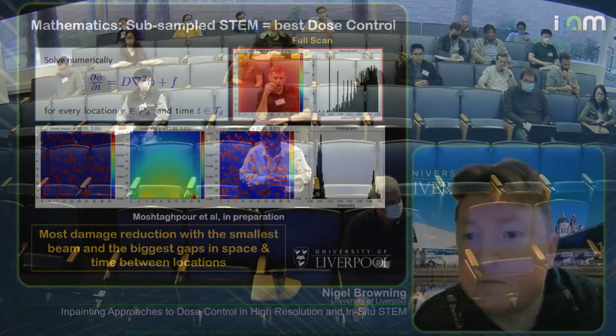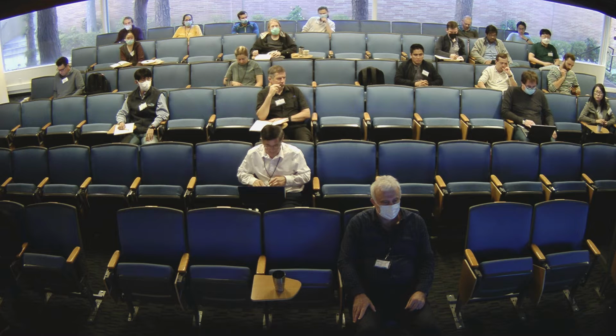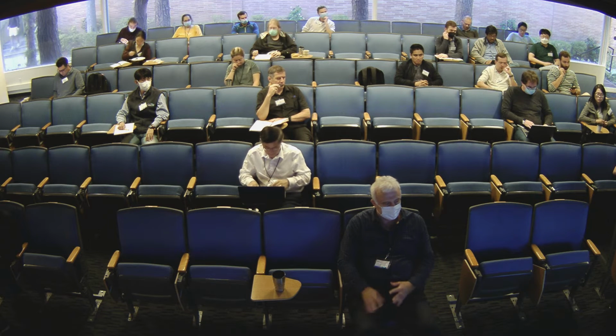Yep, of course. I could imagine two different effects with two different time scales. One of them is you're making diffusing species, and then those diffuse and interact with one another, and that's maybe microseconds to hundreds of microseconds, depending on the diffusion rate.